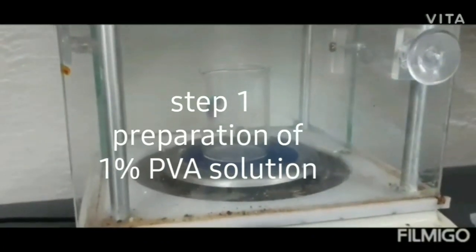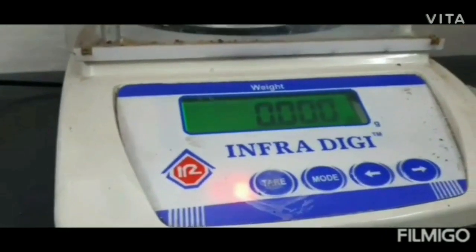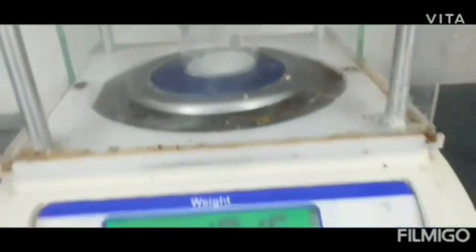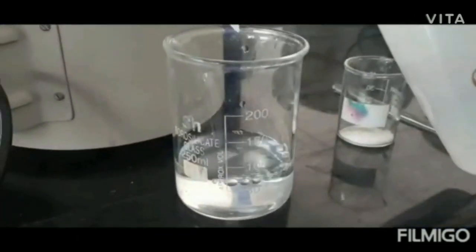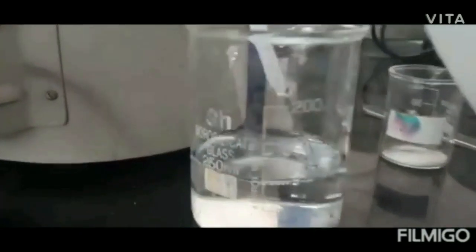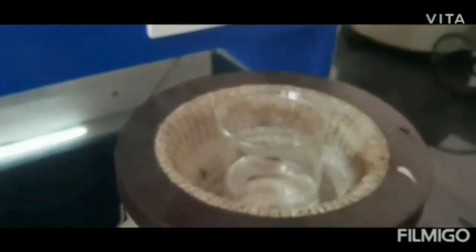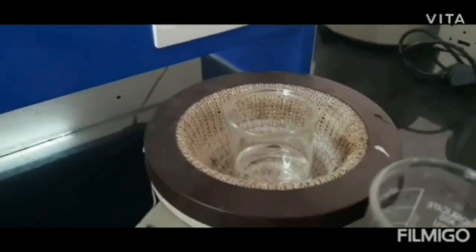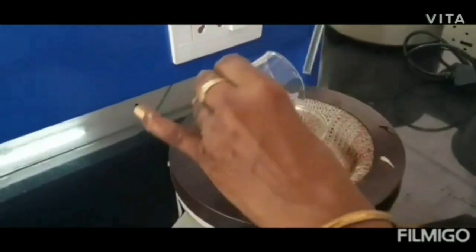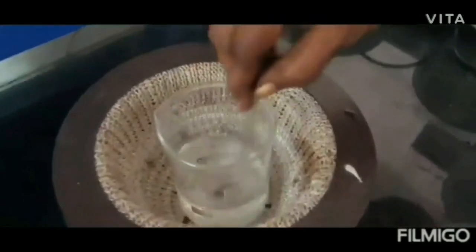To prepare 1% PVA solution, 1 gram of PVA substance is weighed carefully and then dissolved in 100 ml of distilled water. PVA doesn't dissolve in distilled water at room temperature. So first the water is kept in a heating mantle and then the PVA substance is added to the boiling water. The solution is stirred well until it becomes transparent.